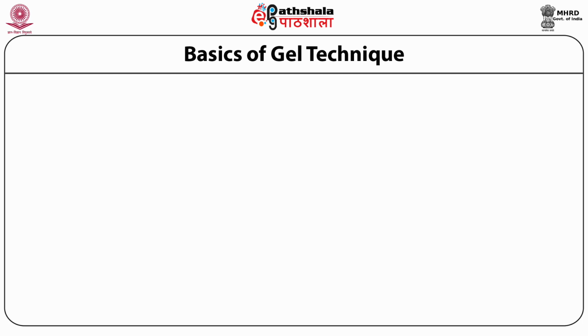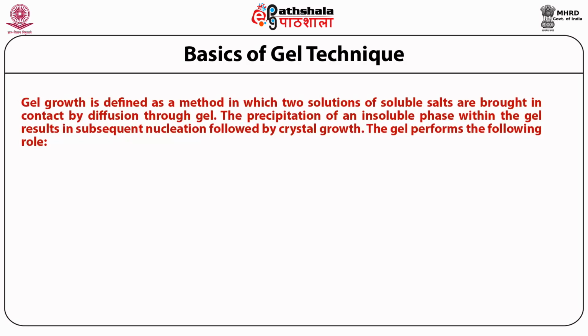Basics of gel technique. Gel technique is defined as a method in which two solutions of soluble salts are brought in contact by diffusion through gel. The precipitation of an insoluble phase within the gel results in subsequent nucleation followed by crystal growth.